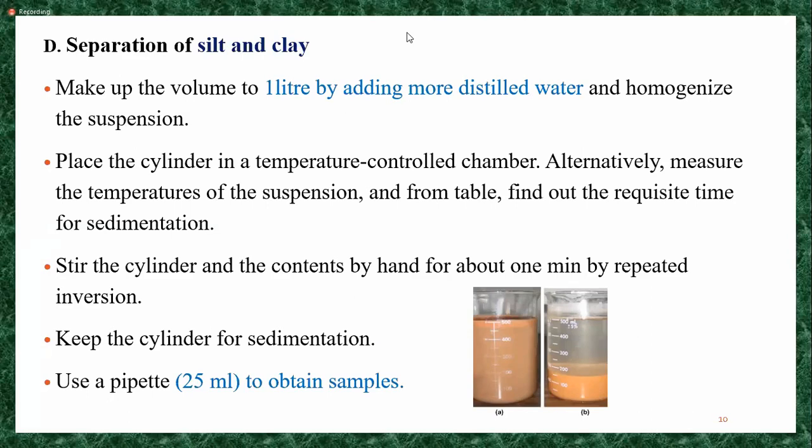Okay, very good. So it takes more amount of time to sediment. Clay takes more time compared to the sand. Clay takes a very long period of time to precipitate in the solution, right?